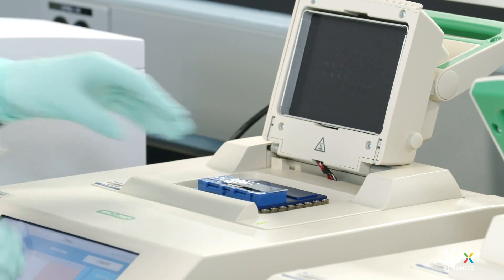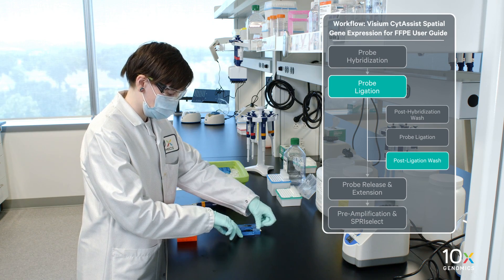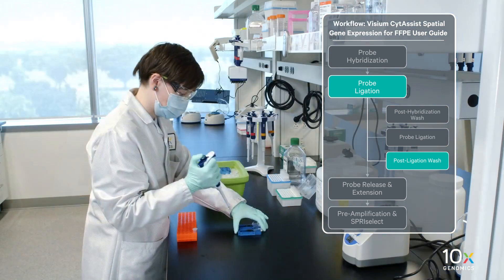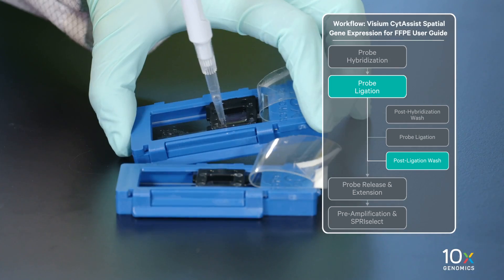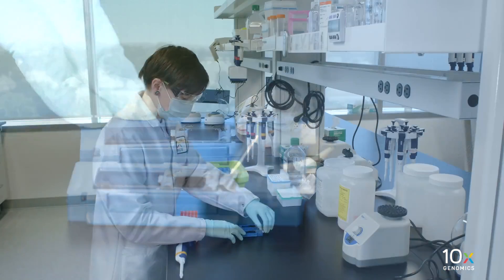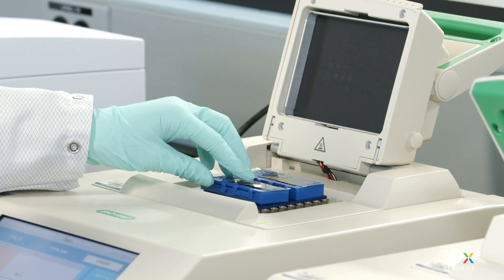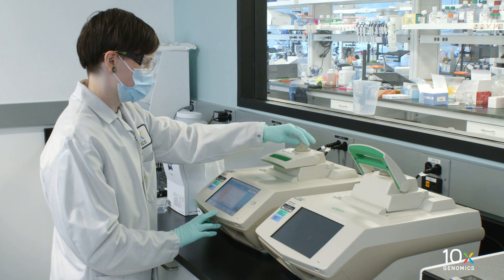Remove the tissue slide cassette from the low profile thermocycler adapter and place on a flat, clean work surface. Peel back the Visium Slide Seal. Using a pipette, remove all post-ligation wash buffer. Add 200 µL of preheated post-ligation wash buffer to each well. Reapply the Visium Slide Seal on the tissue slide cassette and place on a low profile thermocycler adapter on the preheated thermal cycler. Close the thermal cycler lid. Incubate at 57 degrees Celsius for 5 minutes.